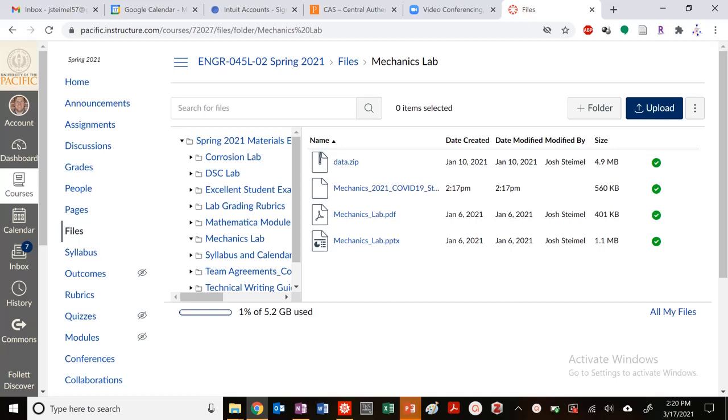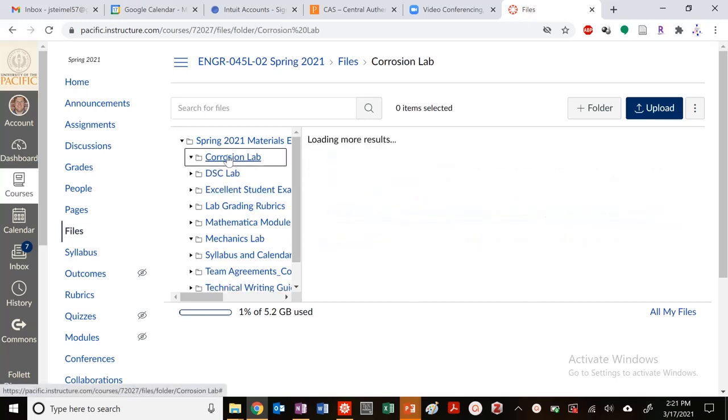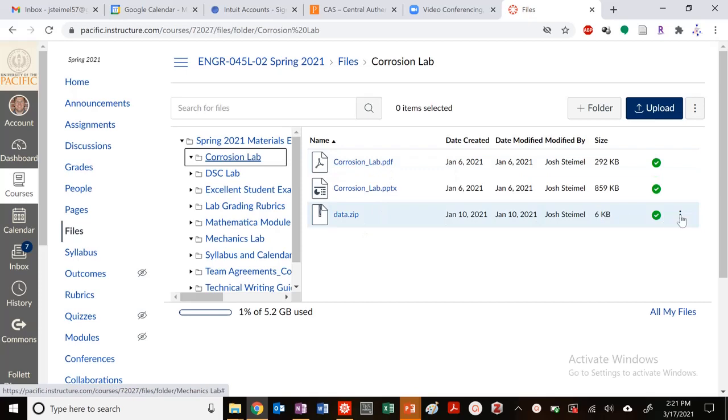We're at our last lab. So you've watched me, or actually we've introduced the corrosion lab and what was going to be done. We've seen the video of how the corrosion lab experiment was to be conducted, and now we're finally getting into the data analysis. So let's look at the data for our corrosion lab.